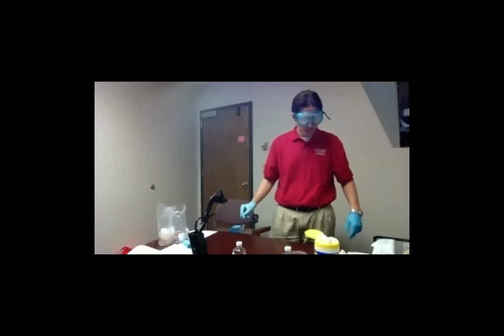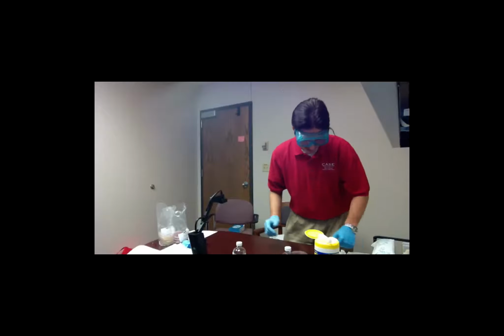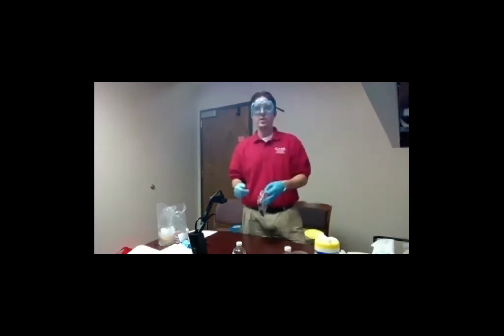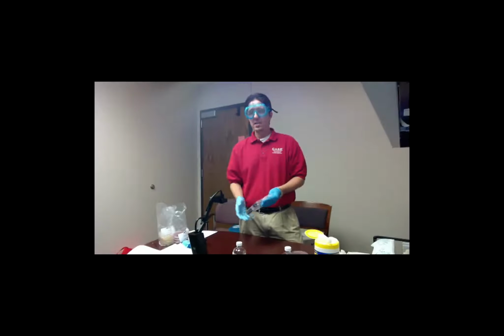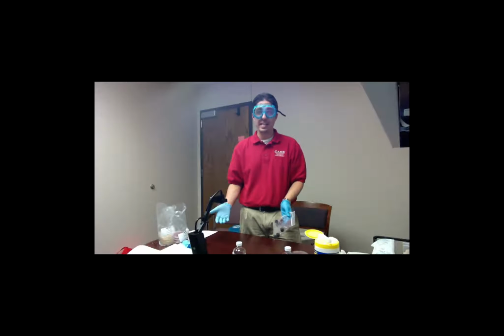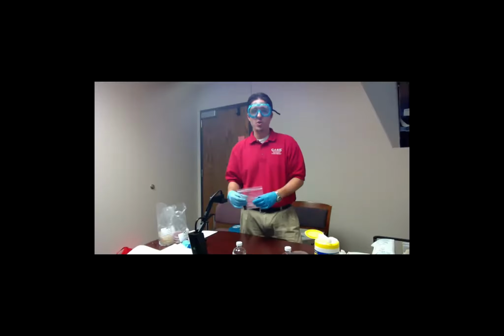Okay. So the next step is, the first thing you have to do is you have to get water. I would suggest getting water locally near your school. It could be a stream, it can be a pond, a lake. It could even be a puddle that's stagnant. But you can do this in a few ways. You can have your students collect it the night before.